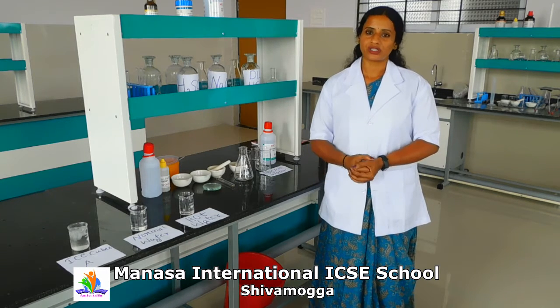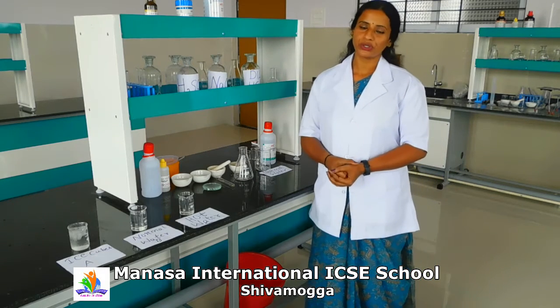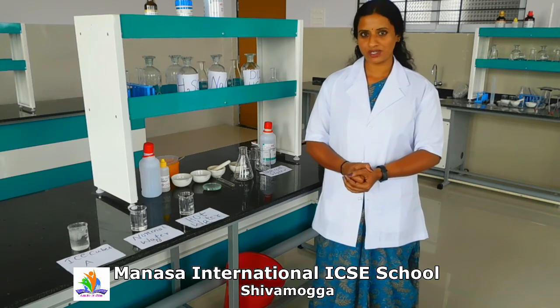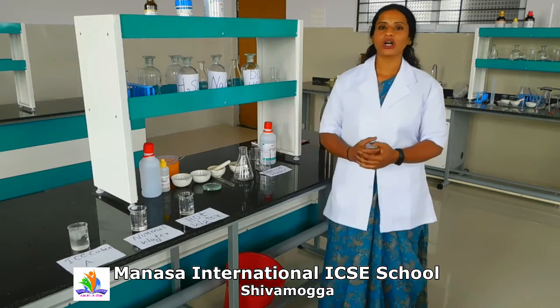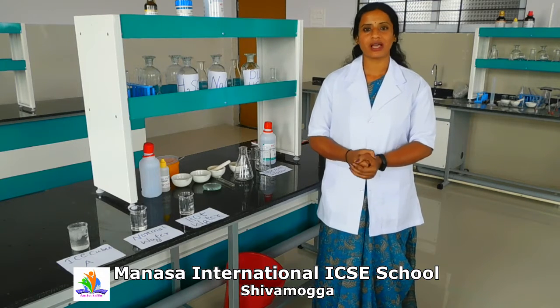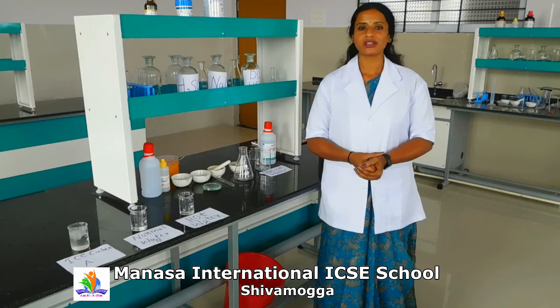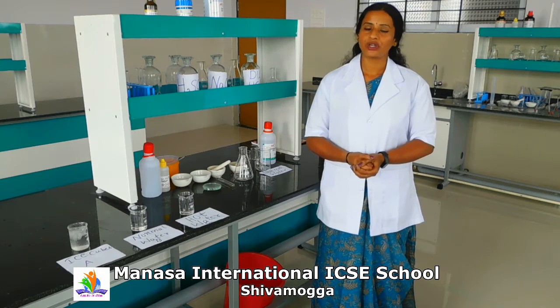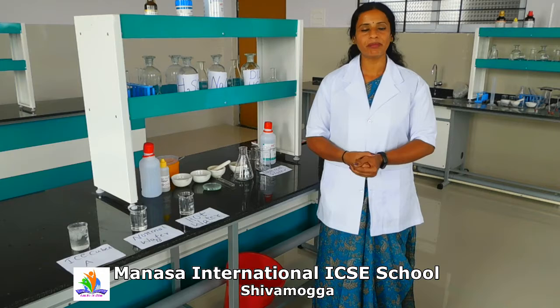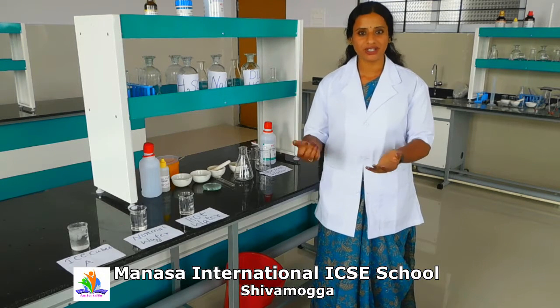Now from this class onwards, I'll be explaining the different apparatus we are going to use and information about them, and also we'll conduct some colorful experiments. First, it is always instructed that a person who works in a chemical laboratory should not work all alone, because there might be chances of the reactions bumping out. At least 2 to 3 persons minimum should be there in the laboratory so that they can concentrate on their work at separate tables.